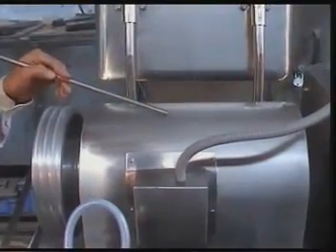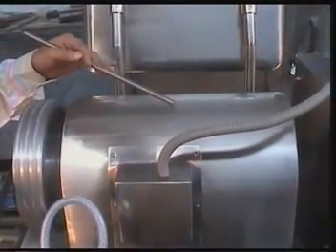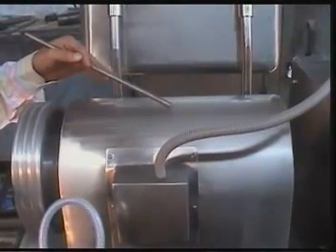This is a 7.5 HP, 1440 RPM main motor of the machine.